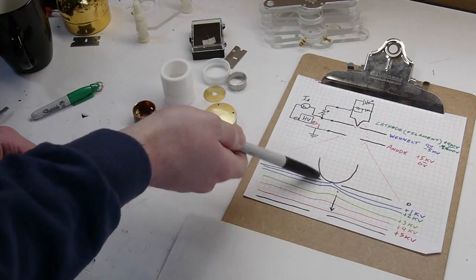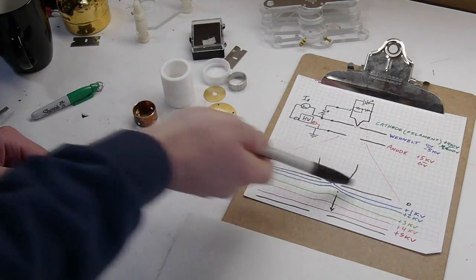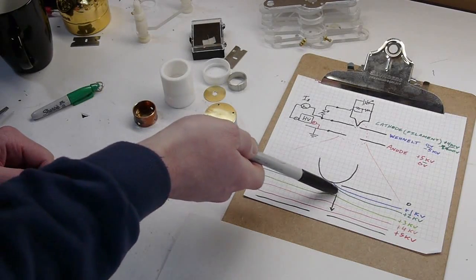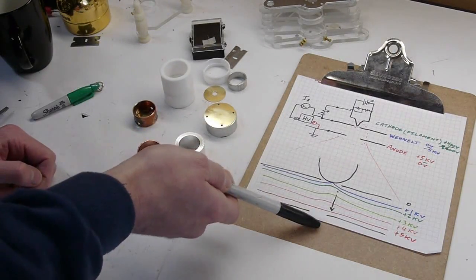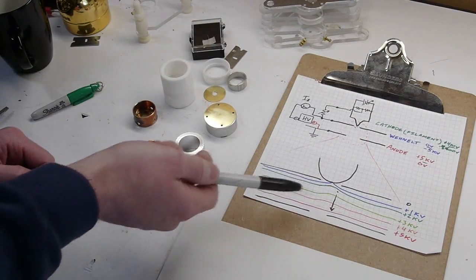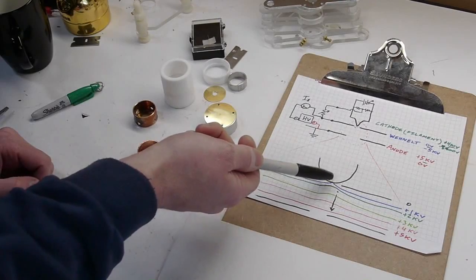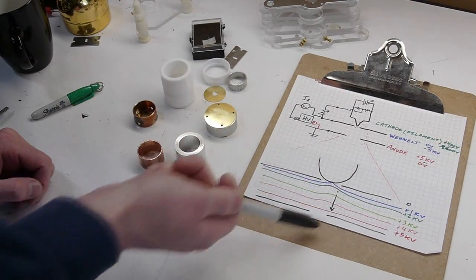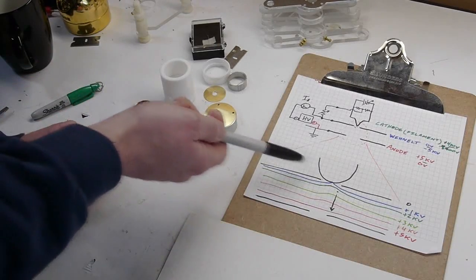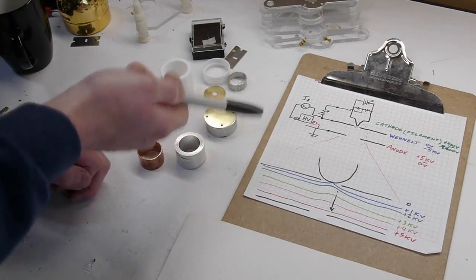So how does this actually work? So if we look at the close-up here, this is the tip of the filament, the Wenelt, and the anode. And I said that if an electron is in this field, it's going to experience a very high acceleration and that's what actually causes the gun to work. So how do they actually make it from the tip into this field, into the accelerating field? And that's controlled by the potential difference between the filament and the Wenelt, which is adjusted by this resistor.